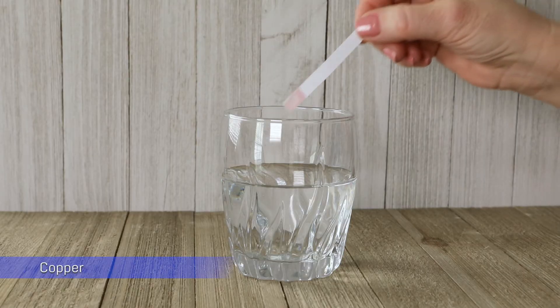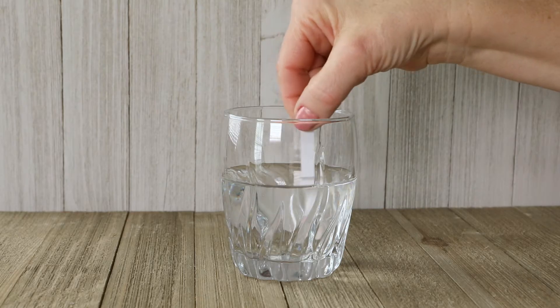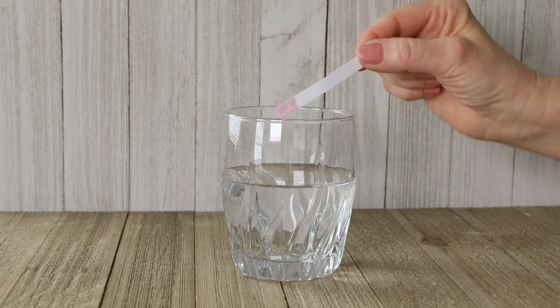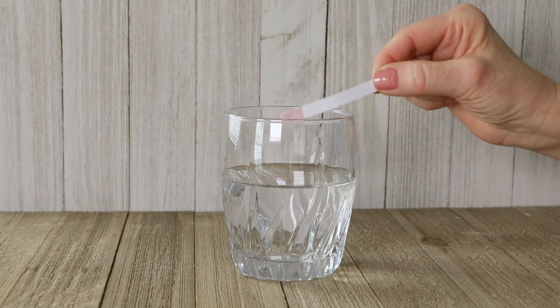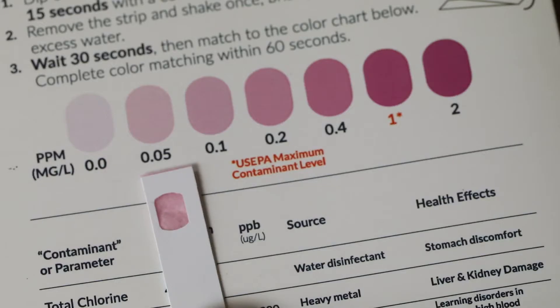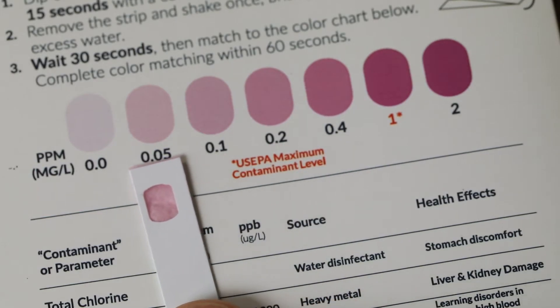Testing for copper is easy. Dip the strip into eight ounces of water and swirl for 15 seconds. Shake off excess water and wait 30 seconds. Fold the strip in half, then compare it to the color chart. The closest match indicates the level.